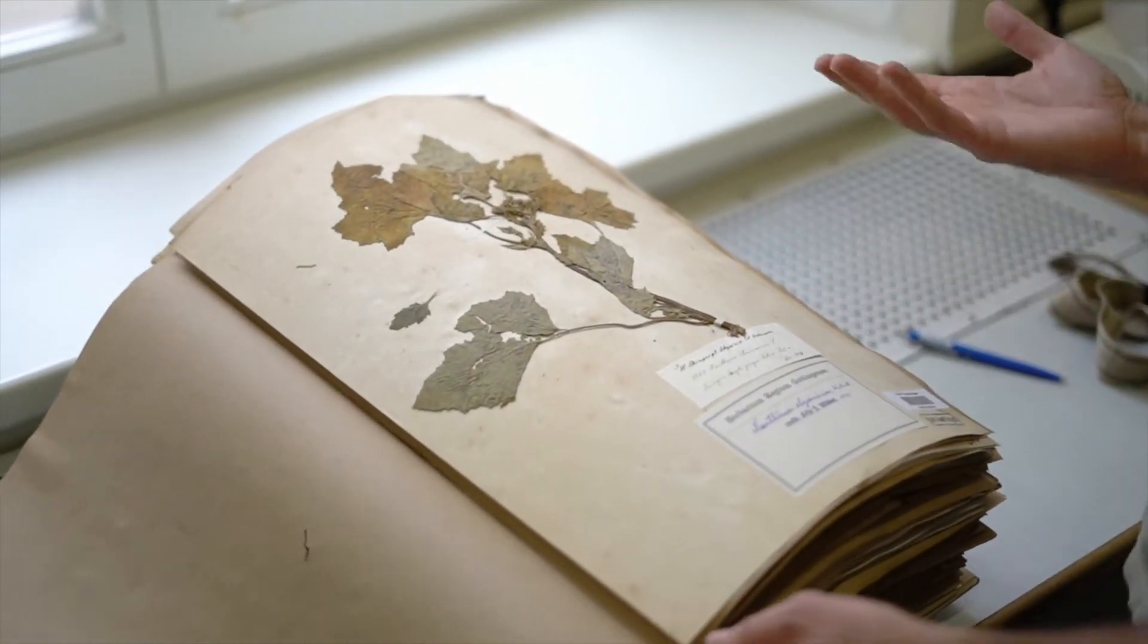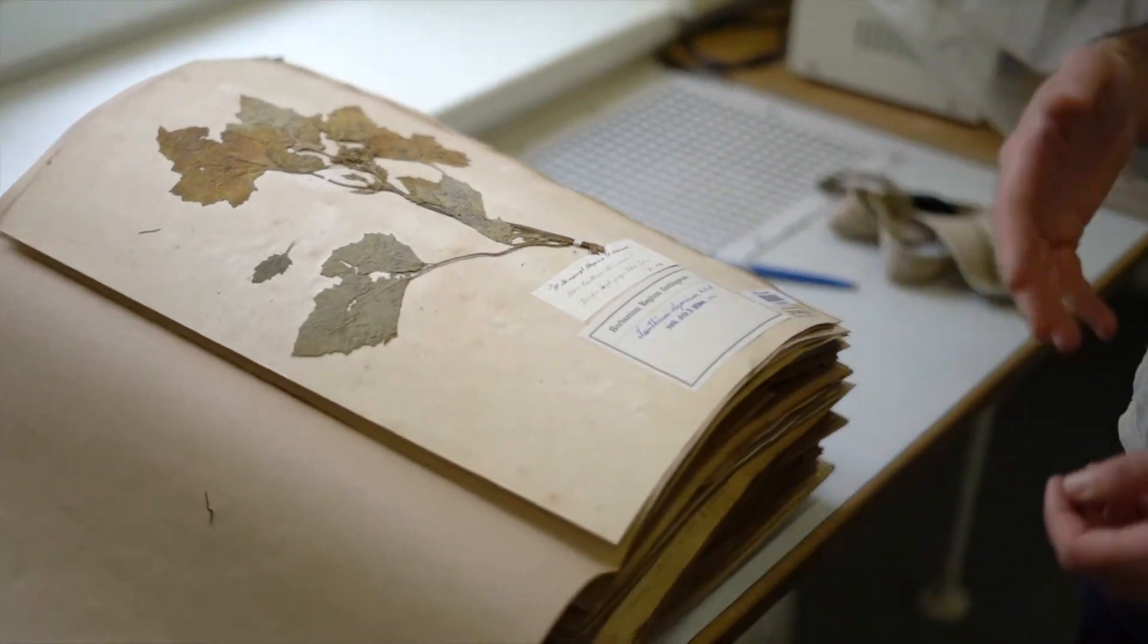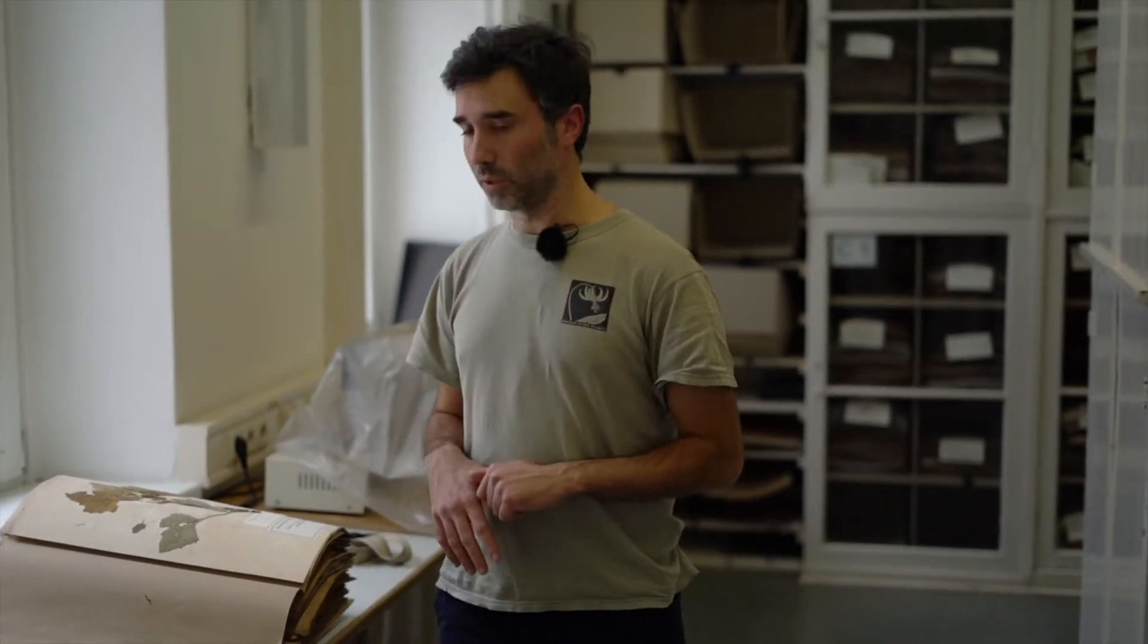For a systematic botanist like me, it would be great to have the possibility to work with those specimens or to take advantage of such a huge collection of plant biodiversity. But there are some issues, especially if you want to work with DNA and sequence-based techniques.